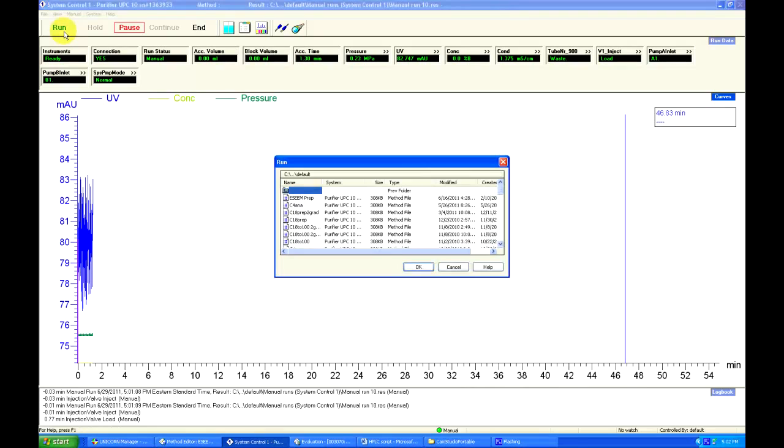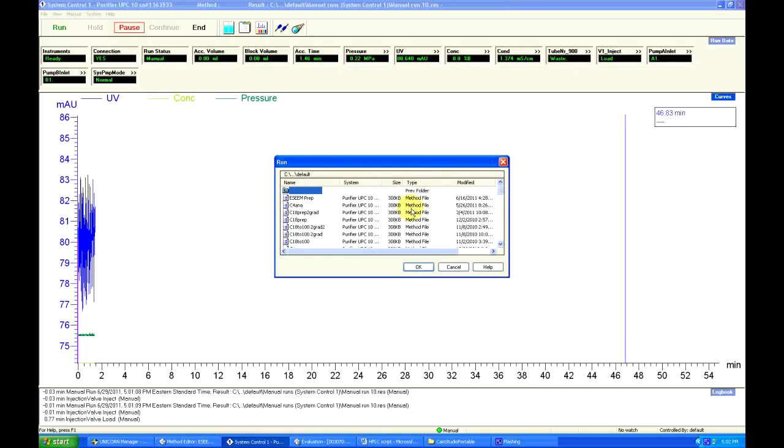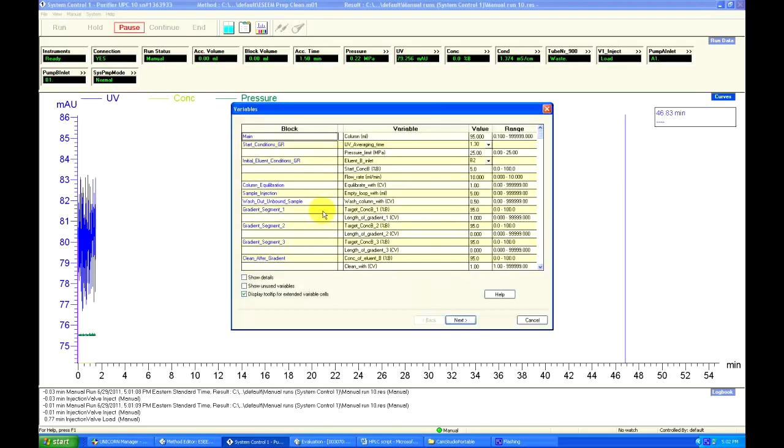Now we can start our run. Click Run. We are greeted with the Run window, which consists of a list of methods we can use. Make sure the method at least matches the scale of your run, whether it is prep, semi-prep, or analytical. After highlighting the desired method, hit OK.